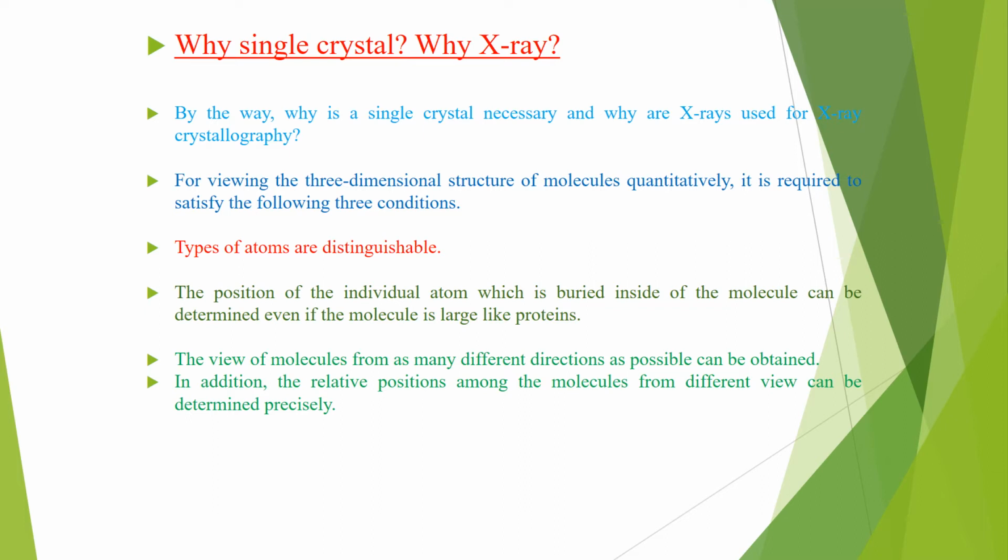In addition, the relative position among the molecules from different views can be determined precisely. So these are the reasons why we use X-ray crystallography.